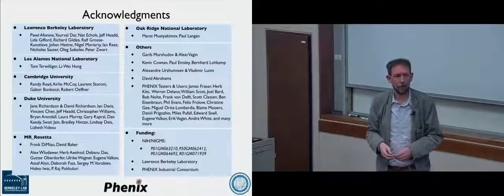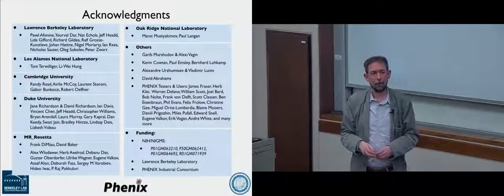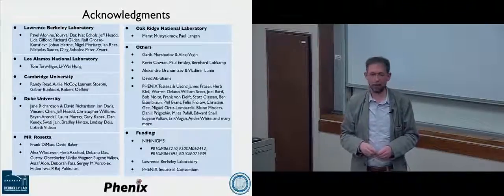Actually, today, people regularly extend from low to high resolution if there's a significant amount of non-crystallographic symmetry. Yes, you can do it with NCS. That's done routinely. That's very powerful. But so far, we are not successful extending from low to high resolution with just moderate solvent, in the general case. You can go from medium to medium high, a little way, shell by shell, but that's about it.